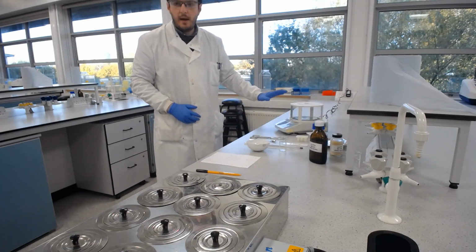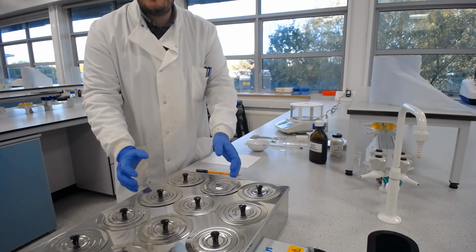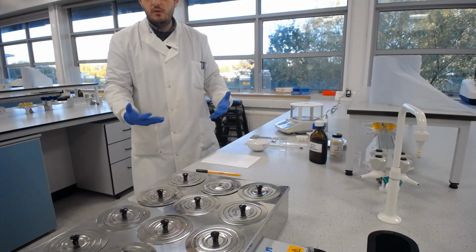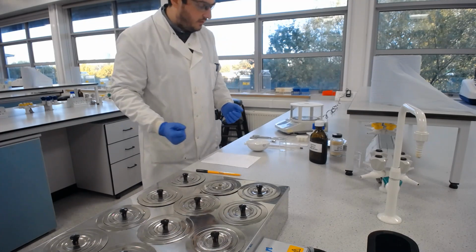Obviously I've got an accurate balance as well, which we're going to use properly. We can see we've got the covers on it. I've got a water bath here, heating to 70 degrees centigrade, so it's warm enough for everything to go into solution or suspension and to be mixed together, but not too hot to change any of those ingredients too much.